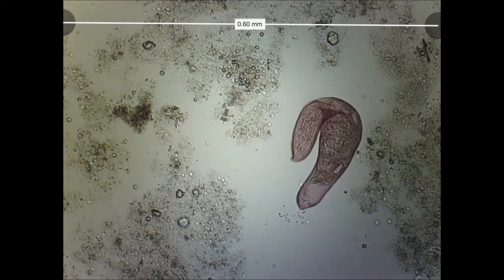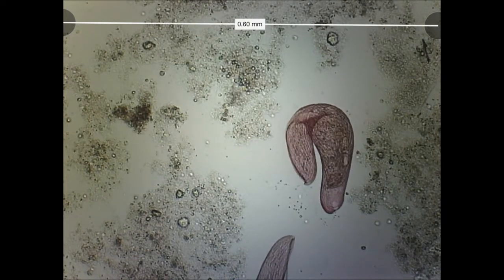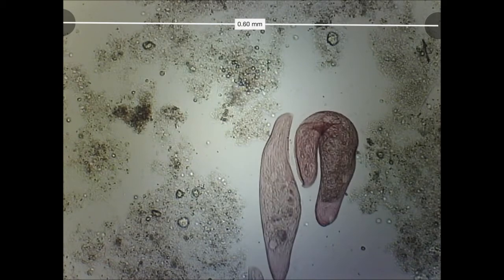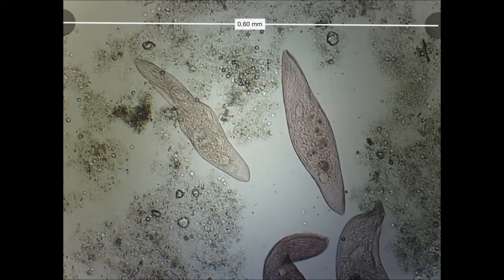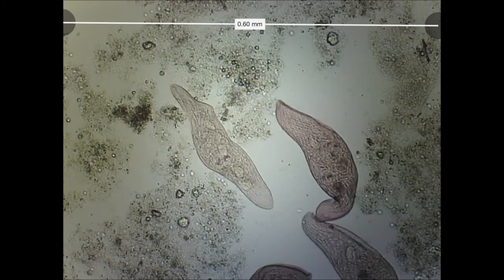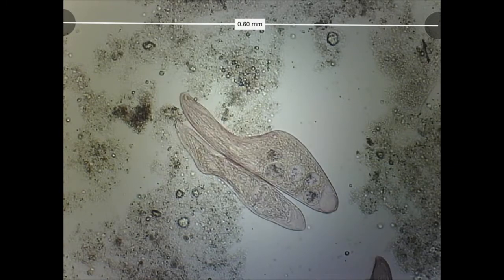If you look closely, you'll see the cilia all around, especially on the feeding edge by the gullet. You'll be able to see what look like long eyebrows, and those are the feeding cilia. All the others are primarily used for locomotion, for swimming.